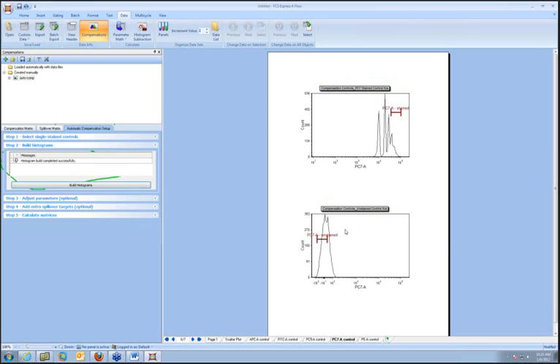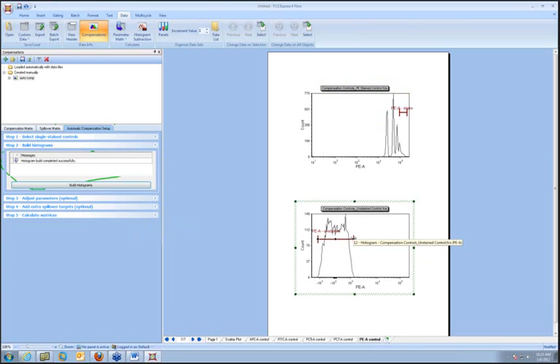I'll go to my PE. Again, I'll make this one a little bit wider here. I don't think my gating is in the best spot to actually be doing this experiment, but I'm not super familiar with this data, and it's not really that important, so I didn't fine-tune it. But normally, of course, you'd have a much narrower, unstained control.